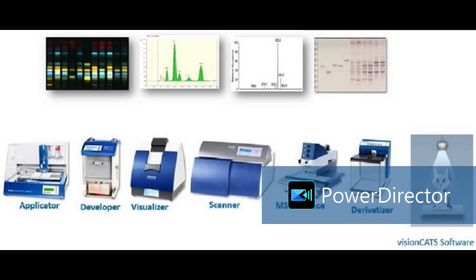Will the distancing be done manually or by the machine? No, from the machine itself. It is automatic through the auto sampler ATS4. Then spot versus band-wise application, we can see the difference. We keep the band length at 4 mm, 6 mm, 8 mm, 10 mm, automatic through the machine. There is no difference with band length, but if we decrease the band length, it is more like a spot. With a spot we get diffusion, but with a band-like shape we get more proper separation and good resolution.